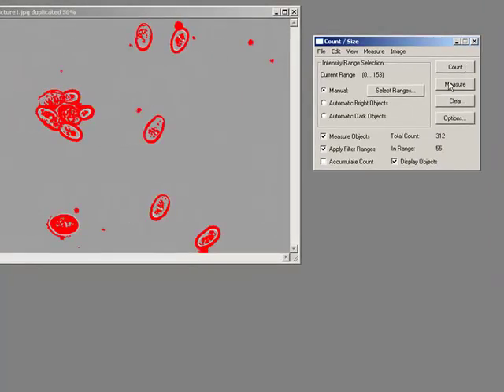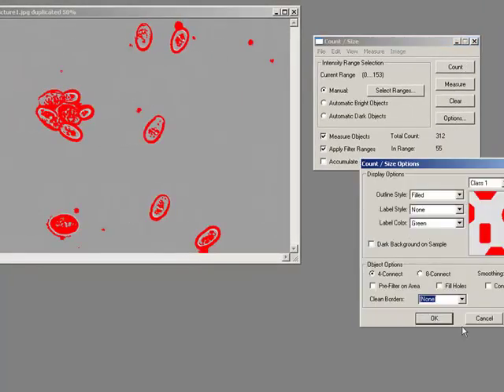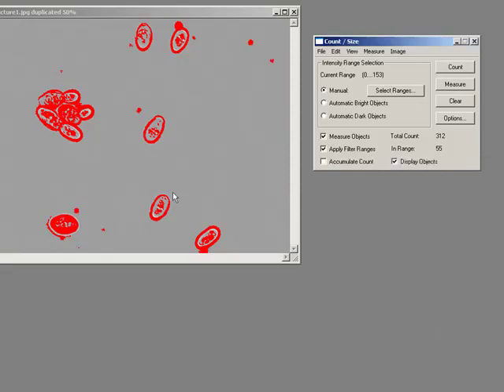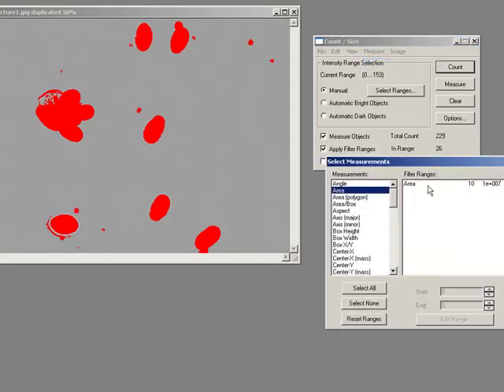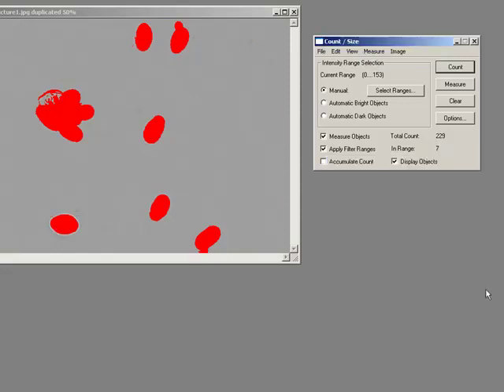And if I count, that's pretty good, and also I'll turn on what's called fill holes. So if this object here has objects in it, when I press count, it goes solid. Now I still have a few problems. I still have this problem here and here, and I don't have the ability to fill in this hole. So the first thing I'm going to do is remove all of the objects, say less than 1,000 items. Boom. And that's got rid of all the little bits of rubbish.